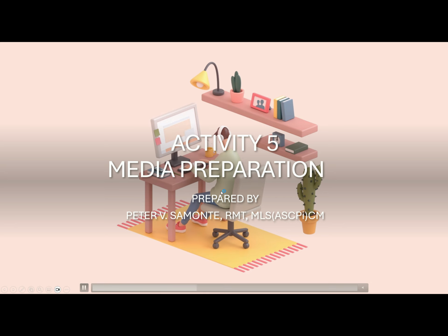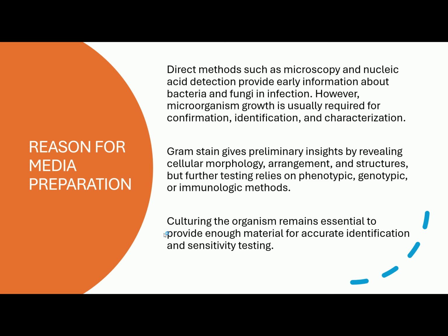So this would be activity 5, media preparation. This would be the first topic for the midterms. Now, what is the reason why we do media preparation in bacteriology? Media preparation, class, is usually done to give a better result.